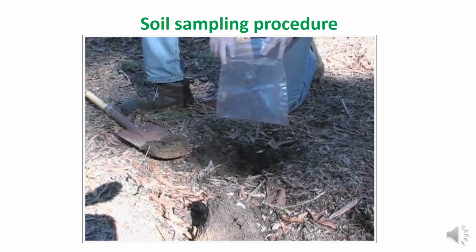After labeling, these bags are transferred back to the lab, where the samples will be processed for further analysis.